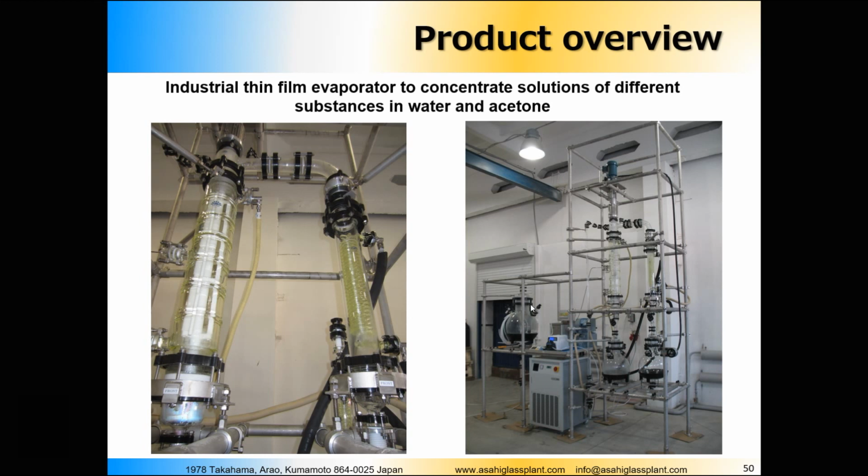So what we did, we put the flask in here, and we had the peristaltic pump, which was pumping the liquid from the feeding flask up to the top, and then the evaporation was occurring in the heat exchanger. And of course we have the cooling machine, the chiller, which was cooling down the condenser, which you can see here. And there was a secondary condenser. It can be slightly seen here at the back, which was protecting the vapors from the receiving flask to go straight into the vacuum pump.